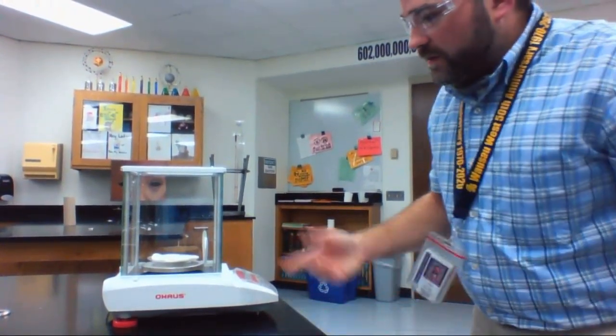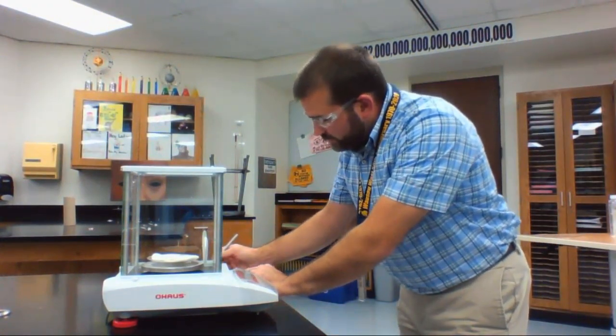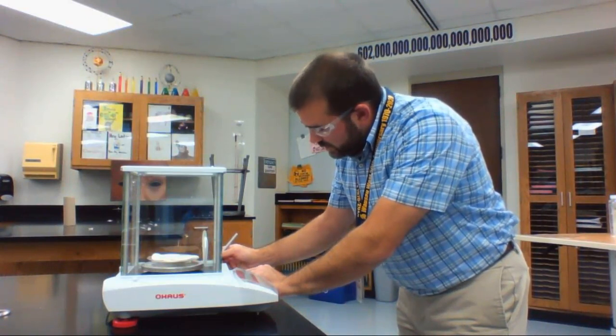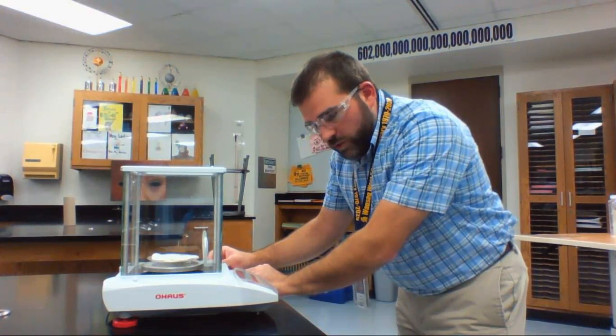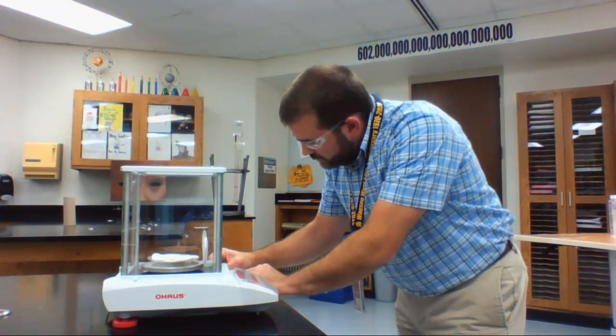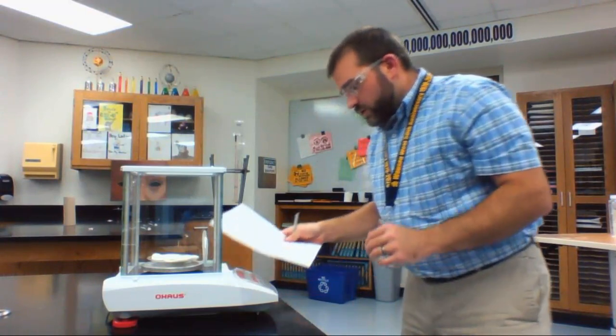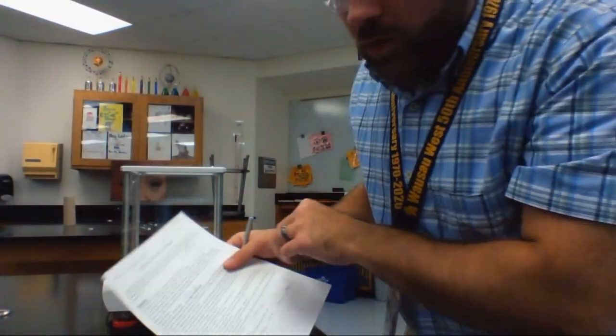Okay, so I have it on the balance. I have closed the door, and now I'm going to read the mass. And my final mass after I am done drying here is 52.063 grams. I'll show you that number. There it is, 52.063 grams. That's the total mass of my watch glass plus filter paper plus precipitate that I've created.